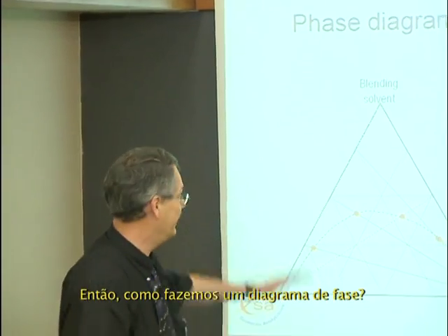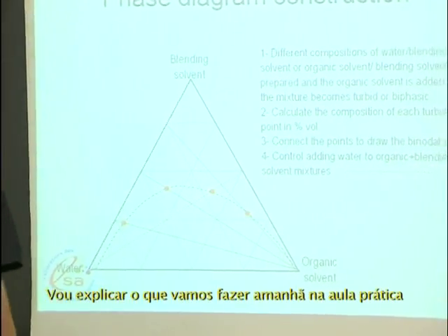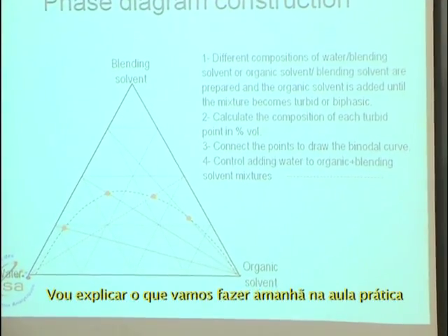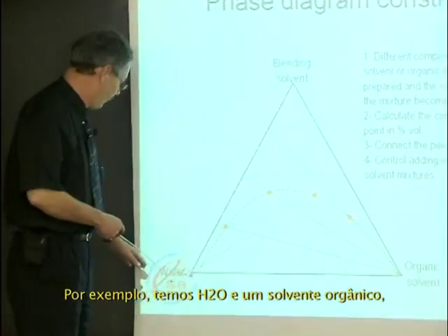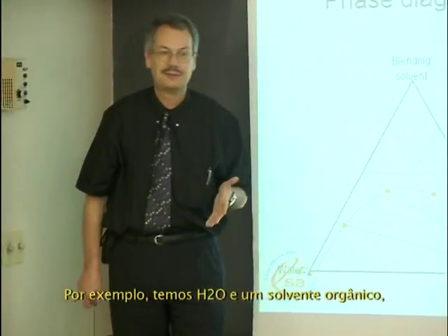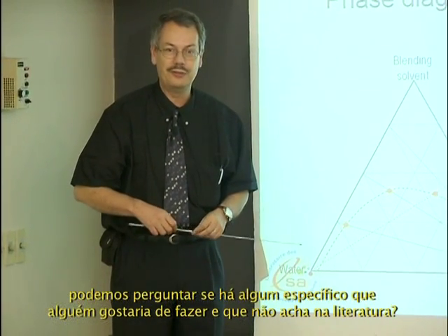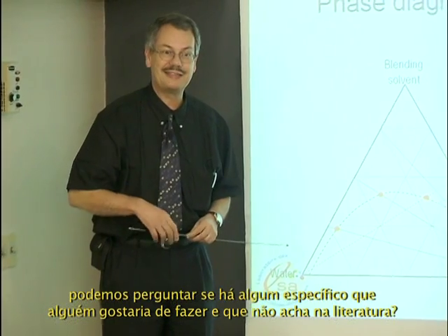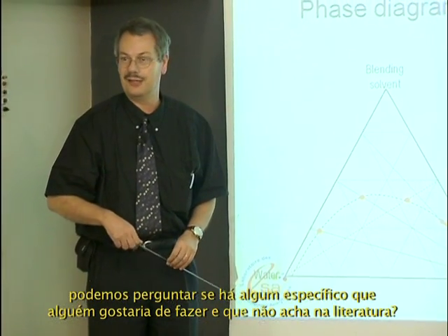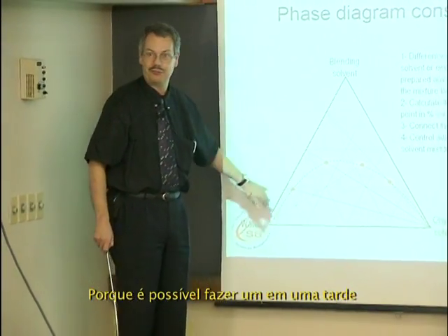So how do we get a phase diagram? I'll just explain what we will do tomorrow in practice. For example, you have water and an organic solvent. I don't know if somebody has a phase diagram that cannot be found in literature and they would like to make it, because it's possible to make one in one afternoon.